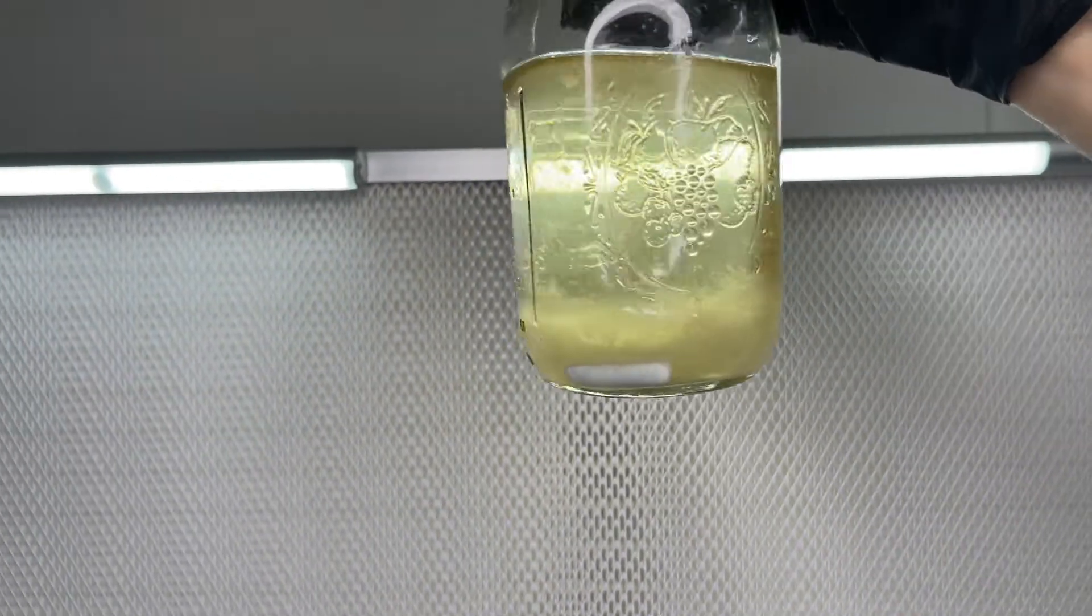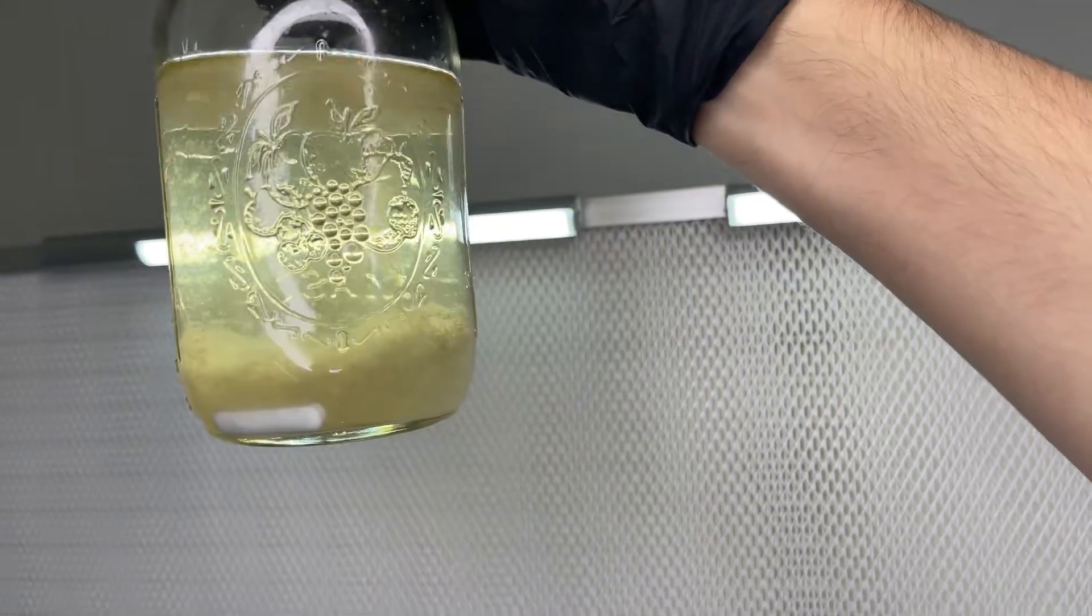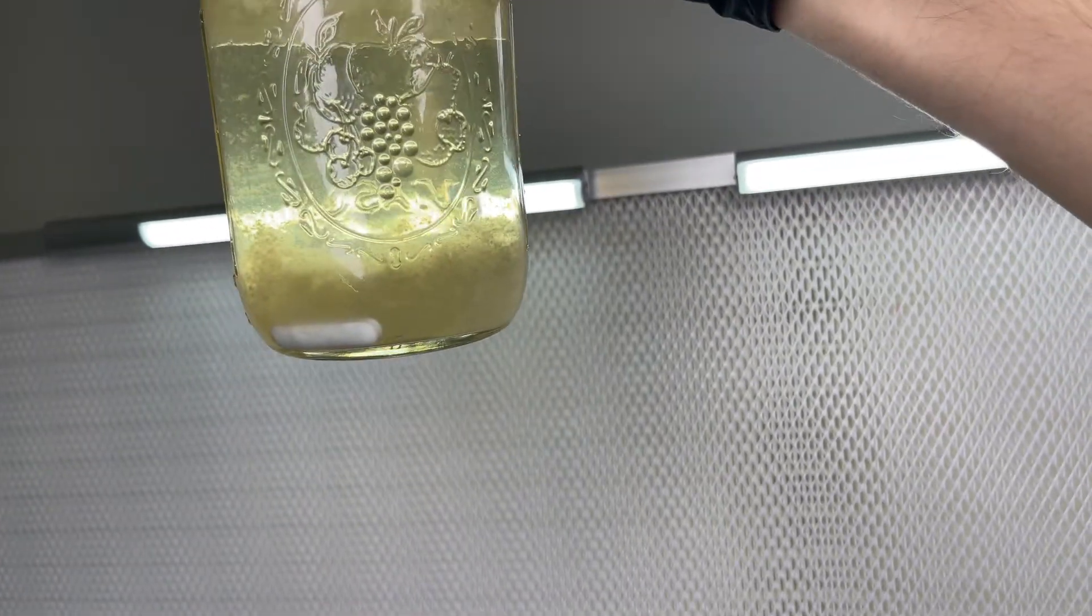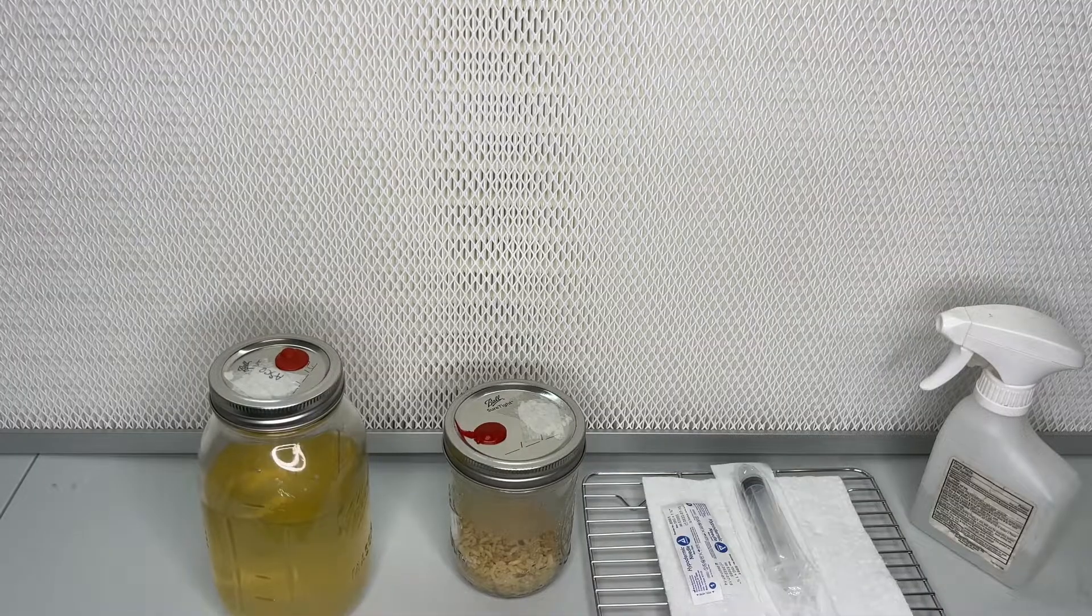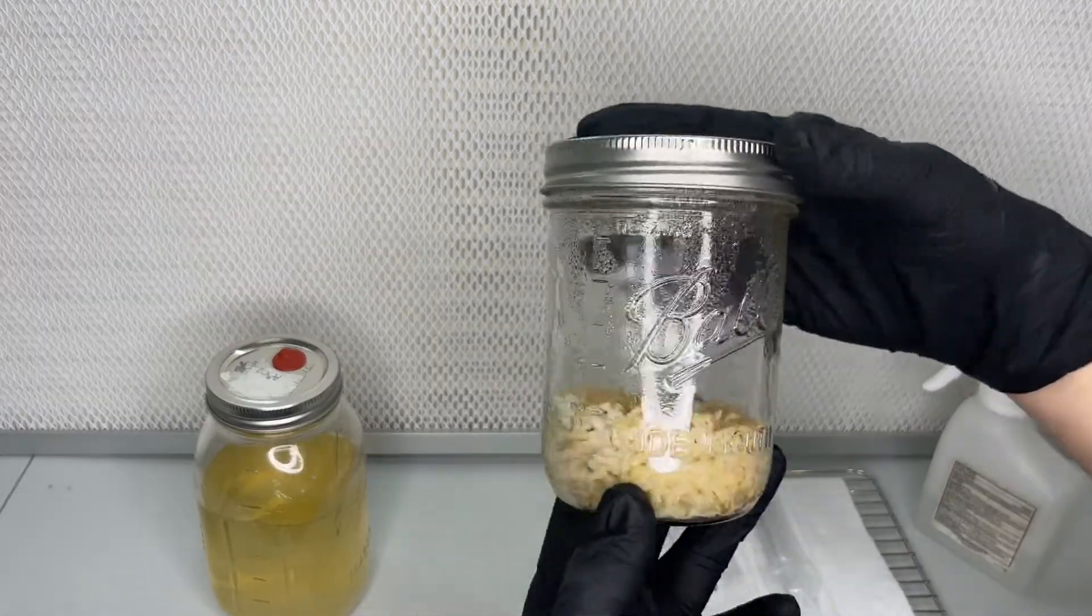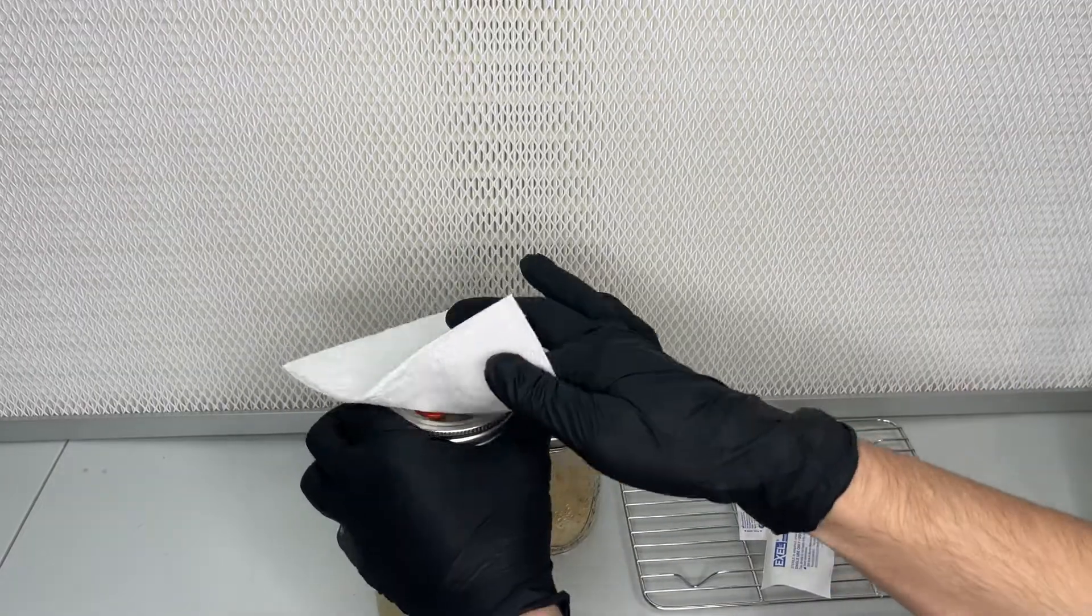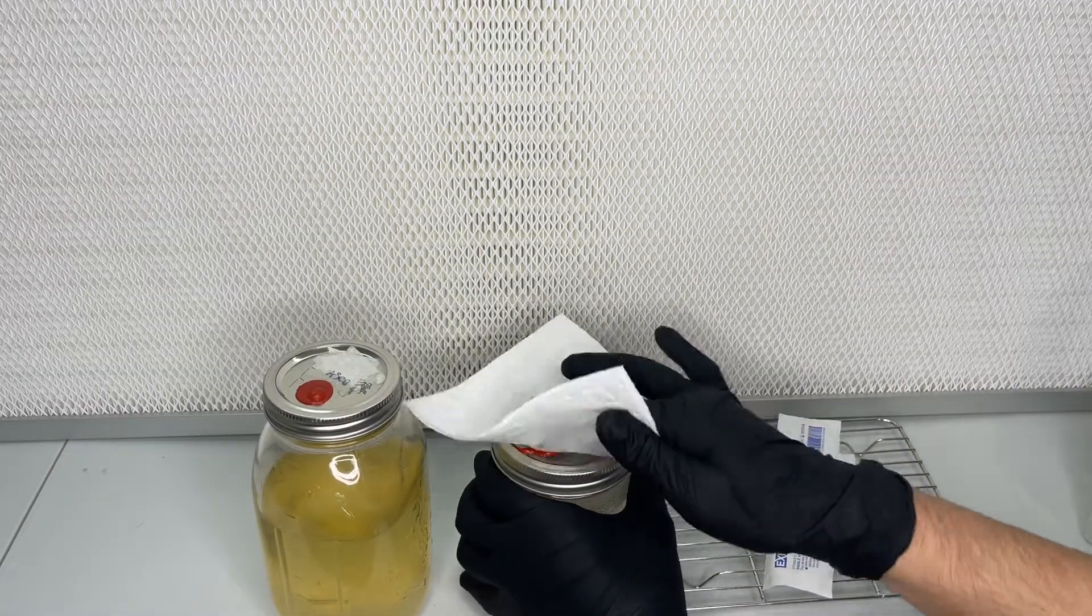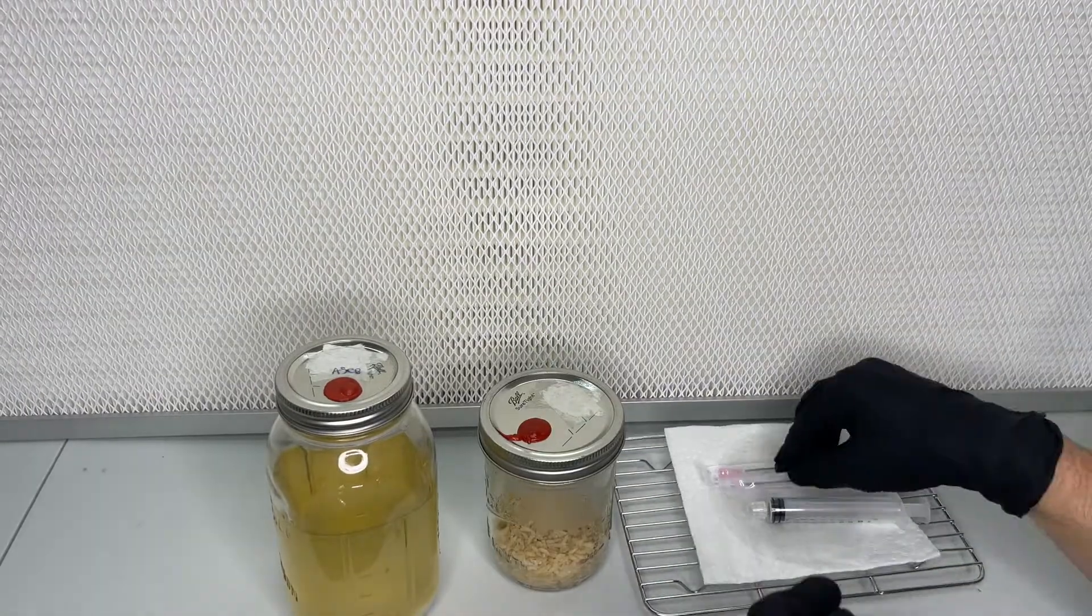At this point, I use a sterile syringe to suck up some of the mycelium and inject it into a sterilized jar of rice substrate. By doing this, I'm testing the fruiting viability of the chosen multi-ascospore isolate. The remaining master liquid culture is stored in the refrigerator until the results of the viability test are known.